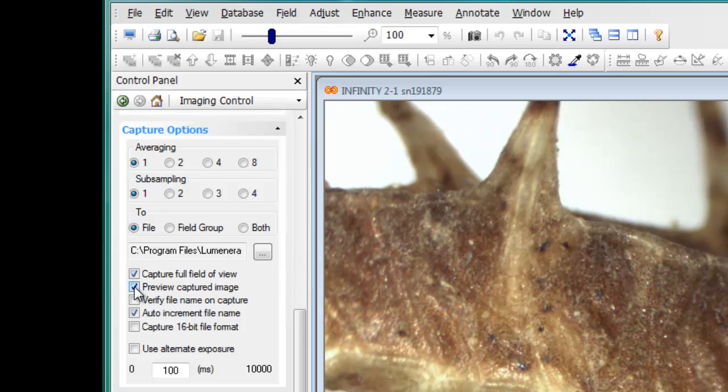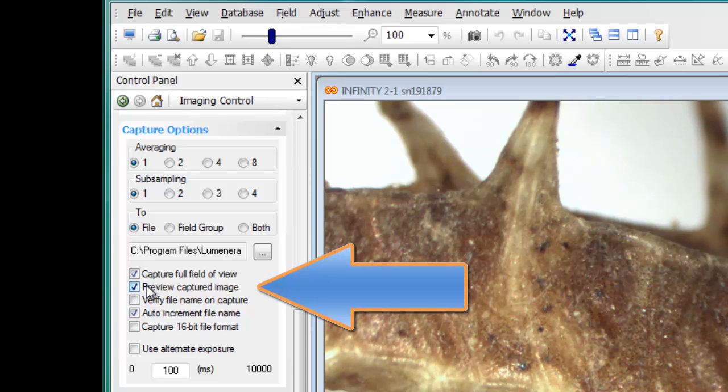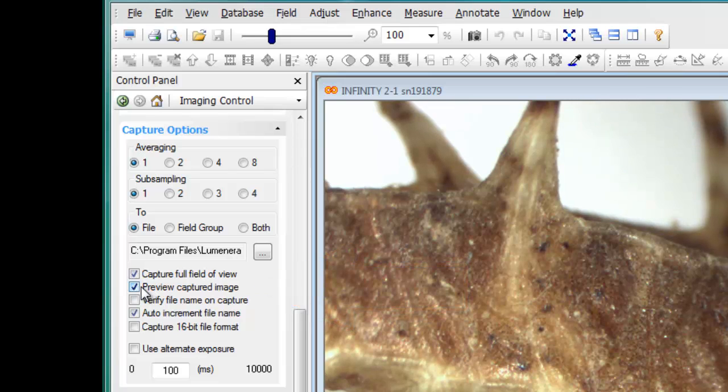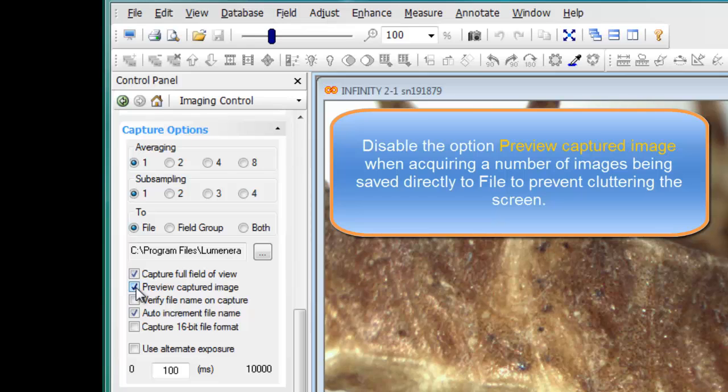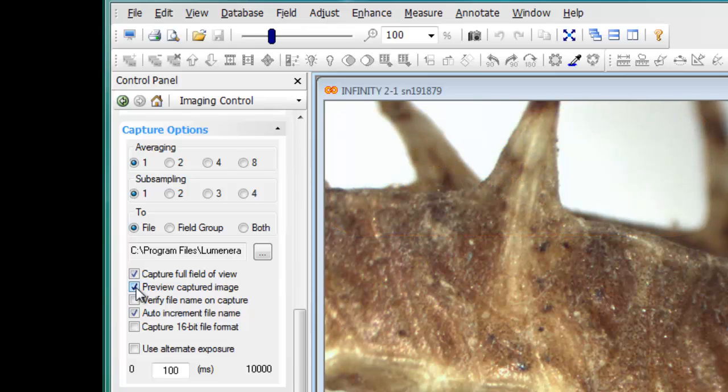Preview captured image is typically going to be enabled if you want to see the captured image appear on the screen each time you click one of the capture buttons. However, if you're recording a sequence of images directly to file, you may want to turn off the preview captured image to save the additional processing of having to open each of those images within Analyze and then manually close them afterwards.